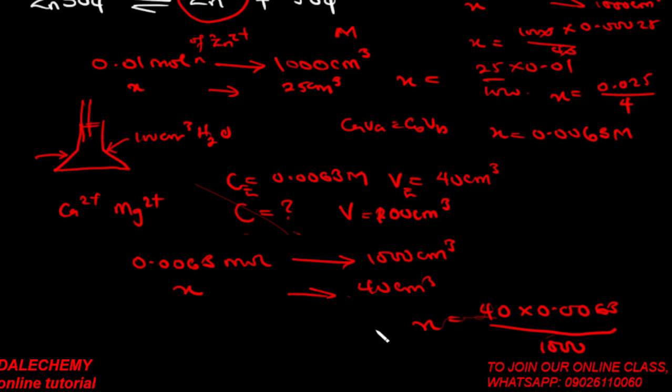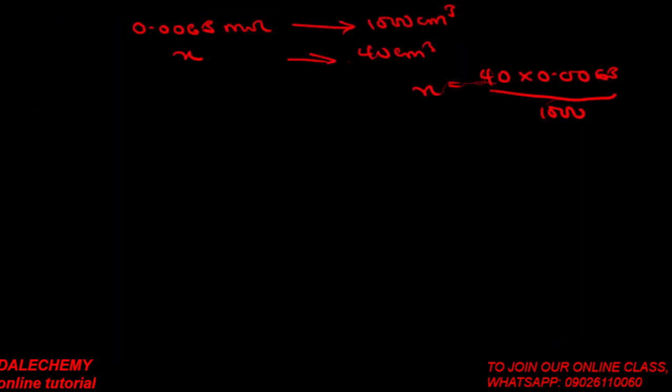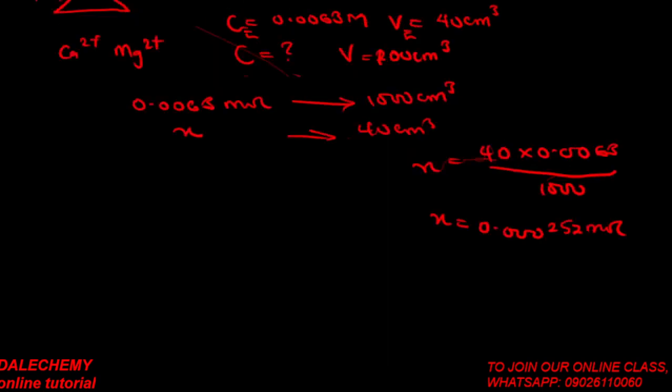When you press that in the calculator, this gives 0.000252 mole. So that is the number of moles of EDTA that actually reacts.